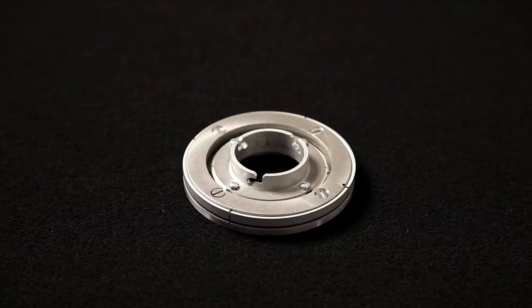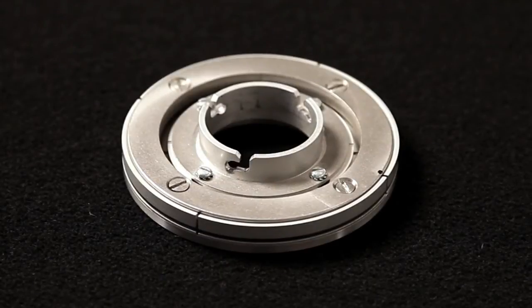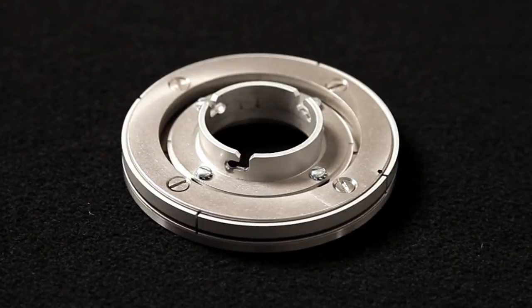The light guide adapter base is fitted to the top of the DSC cell. This provides repeatable location of the light guides in the adapter and can be left in place when running a standard DSC test on a sample which has just been studied using the PCA.